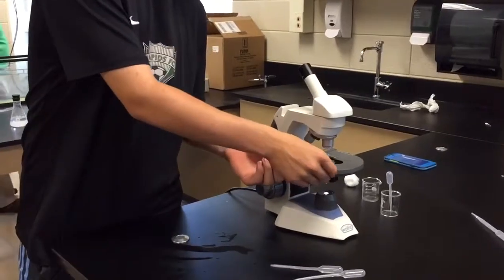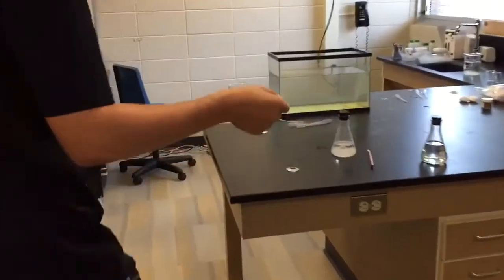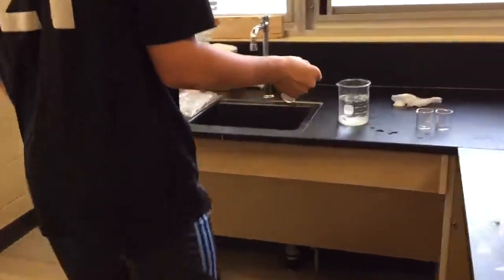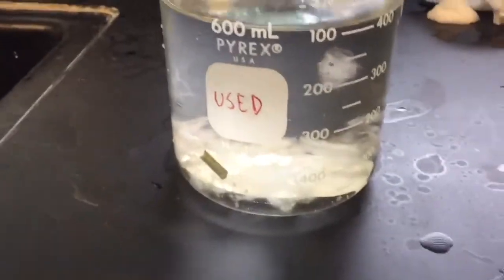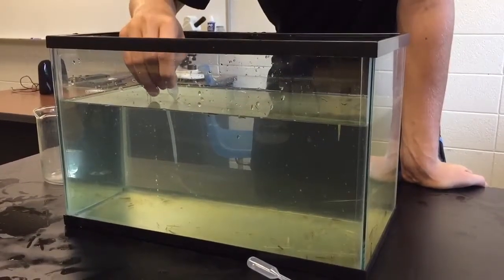Now he will take the slide from the microscope and with the cotton ball and the Daphnia still on it, he's going to take it to the waste container. He's going to put the Daphnia and the cotton ball in there so that it does not contaminate the rest of the results. Now repeat the process but using the other solution.